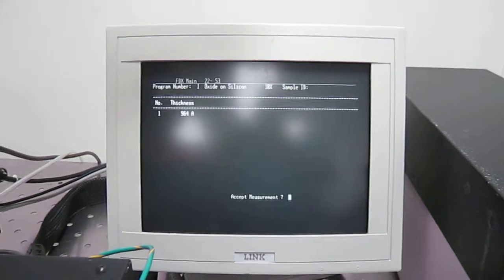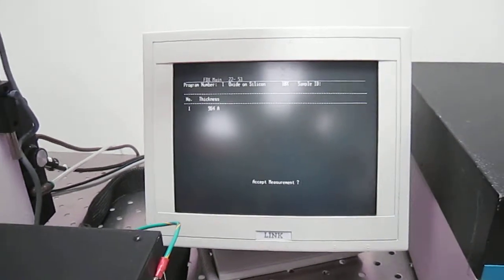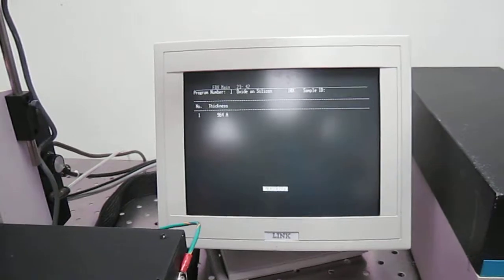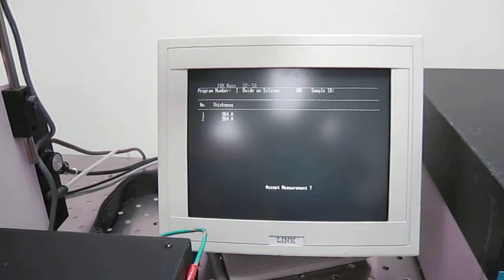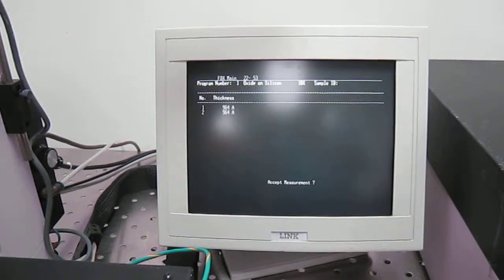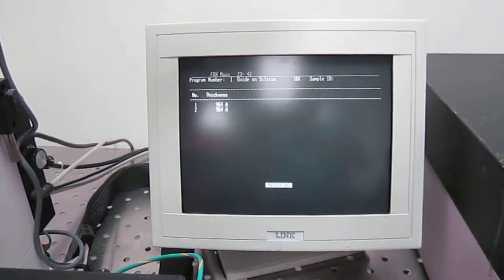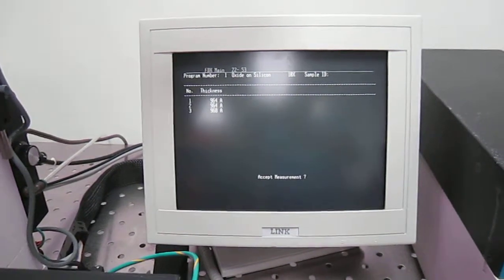Why don't you run it again? Can you get another measurement done? Sure. 964. Do it one more time, another location. 968.